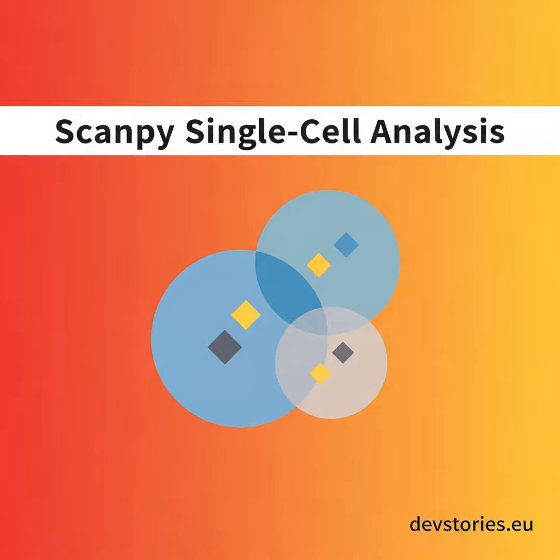Feature selection is not just a computational trick to make your code run faster. It is the deliberate process of stripping away biological white noise so the true cellular identities have room to emerge.